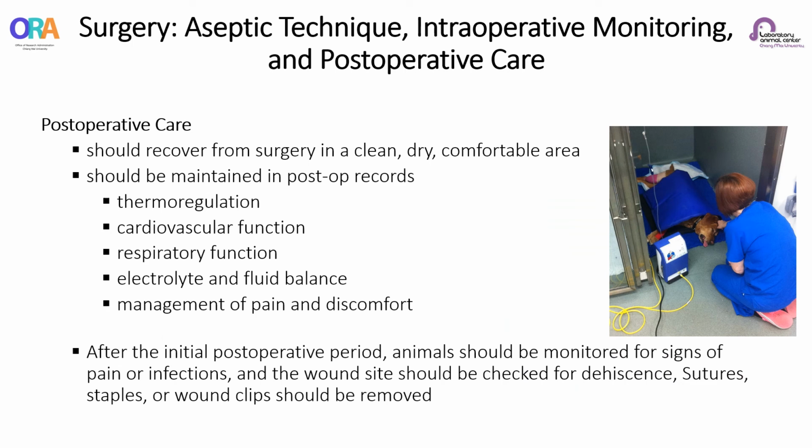And post-operative monitoring is an important part of post-surgical care. The frequency of monitoring will depend on the species and the procedure that was performed. The immediate post-operative period might require greater intensity of monitoring. Post-operative animals should recover from surgery in a clean, dry, comfortable area where they will be observed by trained staff. Appropriate documentation of monitoring parameters should be maintained in a medical record.